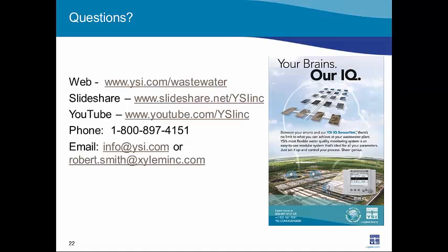You've got SBR. An SBR is a fairly dynamic process. So we talked about you want to do a verification or matrix adjustment when the process is stable. There may be limited opportunities for that, for example, with ammonium and nitrate in a SBR. We have a customer who has found, again, I have to credit them, this innovative method.